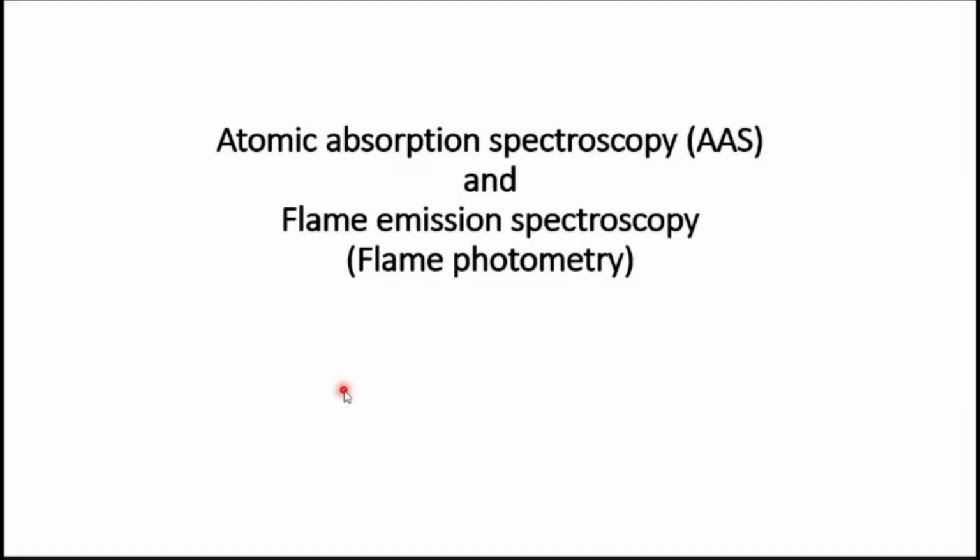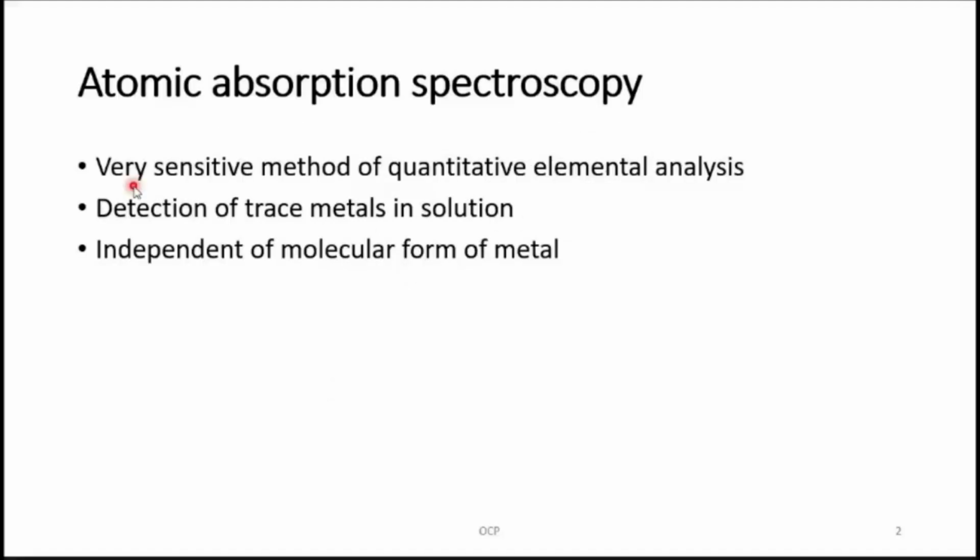Absorption spectroscopy and flame emission spectroscopy. Flame emission spectroscopy is sometimes also called flame photometry. We will first start with atomic absorption spectroscopy. As the name suggests, it is concerned with atoms and not with molecules.